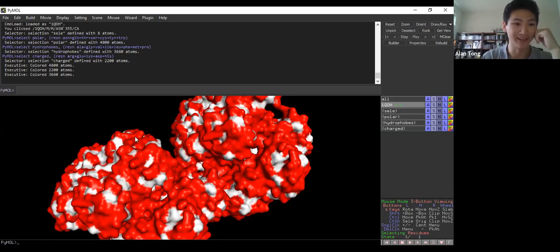The surface looks weird. So Mahi asks, so the hydrophobicity, hydrophilicity can be determined by the software, which can determine the function of the protein, like how it enters. No, so that's up to our interpretation, right? So function is from us. The software can calculate which amino acids are hydrophilic, which are hydrophobic, but we have to interpret that. So we have to look at what polar contacts there are, where are the hydrogen bonds, and we can then determine the function of the protein.